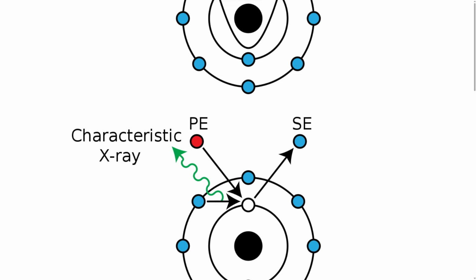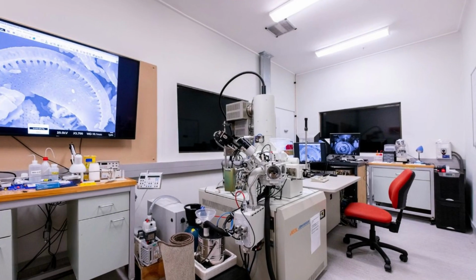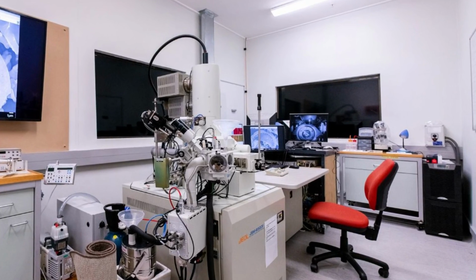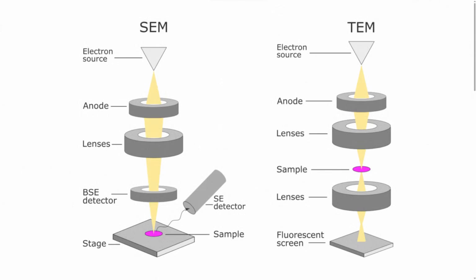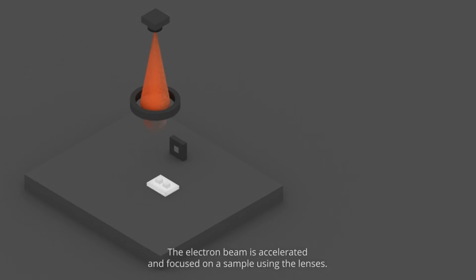In electron microscopy, instead of a light beam, we use an electron beam, and we scan the electrons emitted from the object or the surface. The focused beam is directed to the surface, magnified, and scans the surface, and whichever electrons are moving around its atoms will be displaced from the shells or the clouds they are rotating in around the atoms. They will stay in the chamber, where there is a vacuum, and a detector will absorb them and scan. We'll have the image of the surface depending on how many electrons we register.